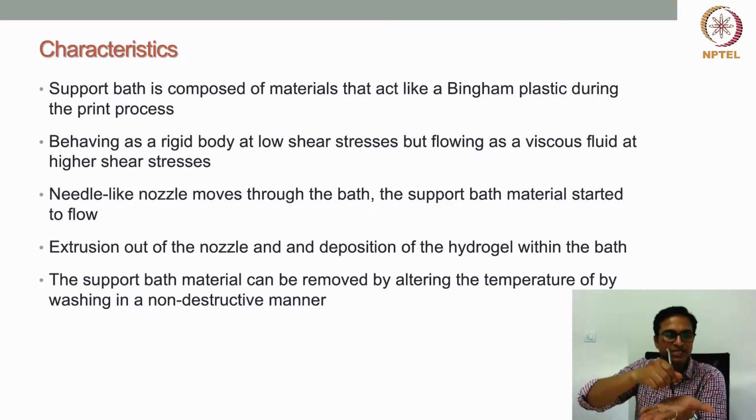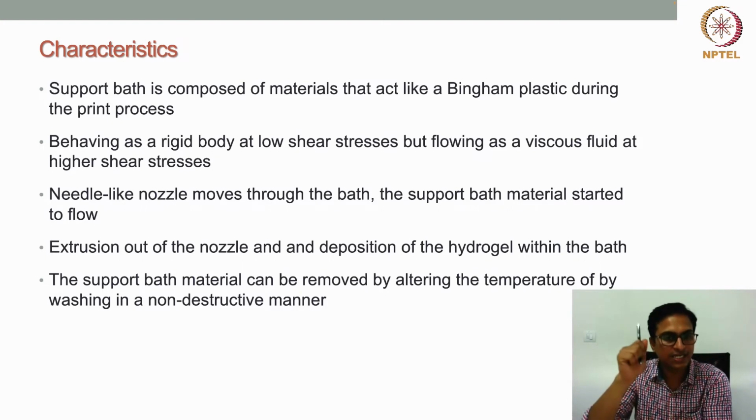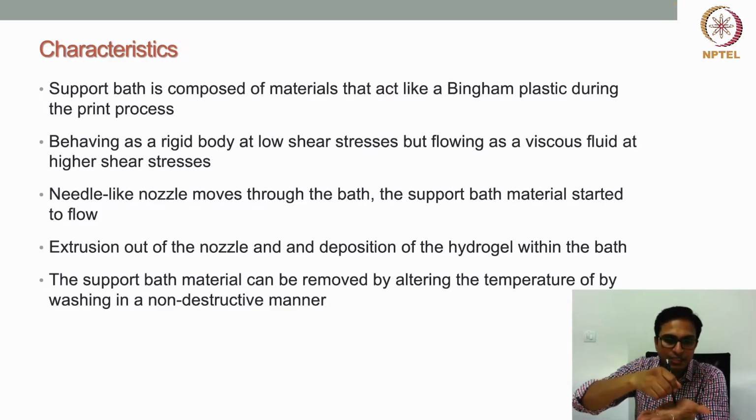But when we start moving the nozzle and apply shear stress, and the shear stress reaches that critical stress, just remember, the yield stress, then the support bath material will start flowing. So it provides space for the nozzle to move, right?